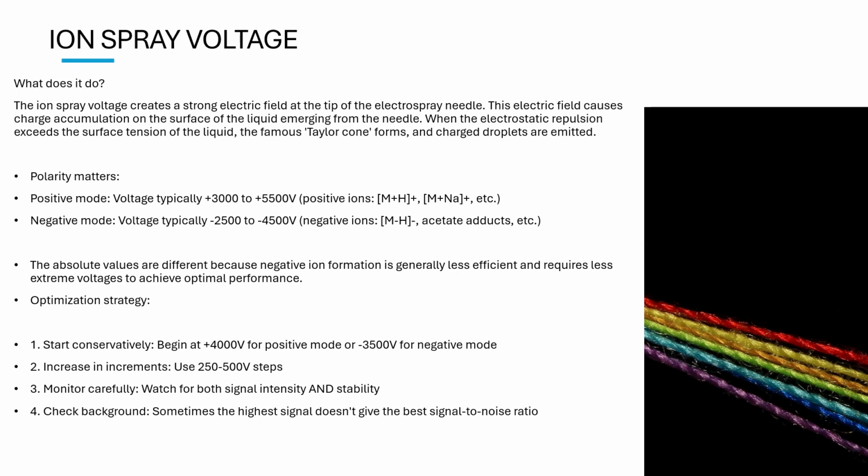For positive mode, voltage typically around 3000 to 5500 volts is provided, and in negative mode it is minus 2500 to minus 4500 volts.